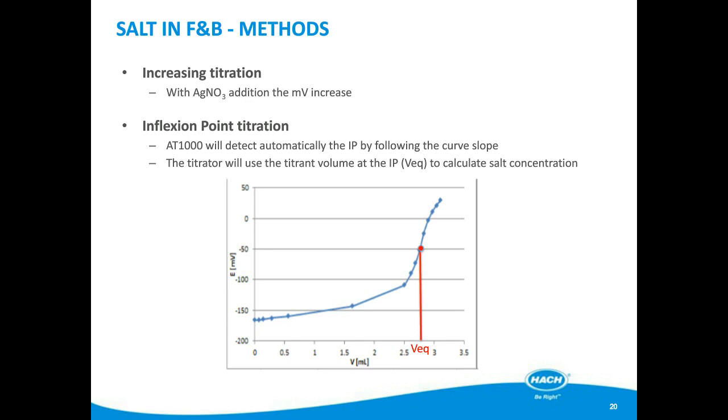As soon as the instrument finds this equivalent volume, it will calculate the result and give you the result in the correct unit that you have selected.